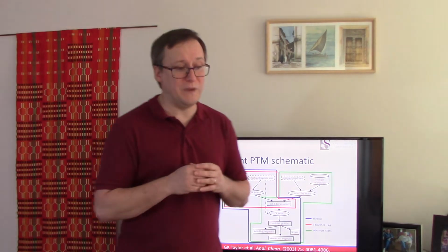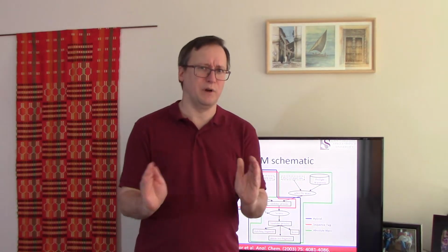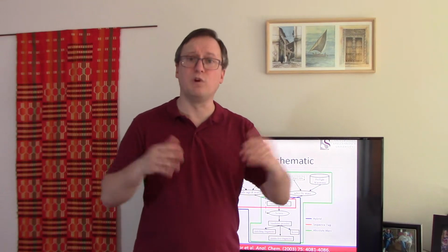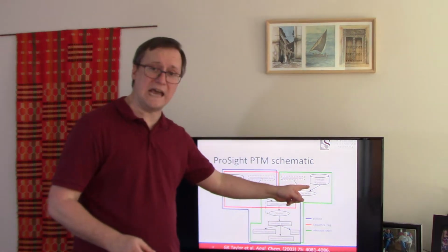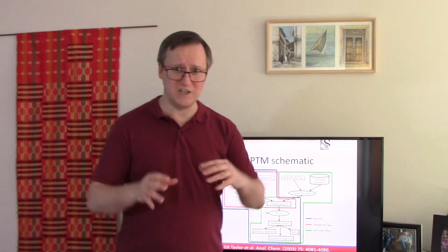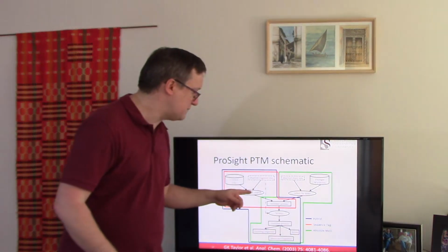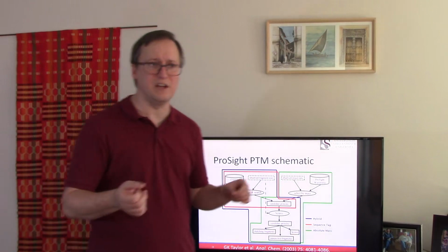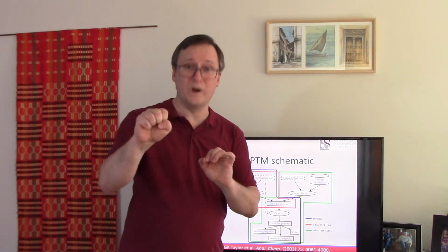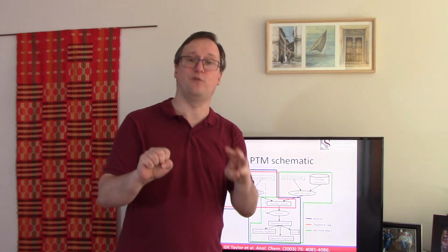For example, you may have said, I know this protein plus 3 phosphorylations and 1 acetylation equal the mass that I saw for the intact ion of the proteoform. And I've confirmed internally that the sequence matches to this FASTA sequence. That's great. But I don't know where this 1 acetylation and these 3 phosphorylations are located on the sequence.